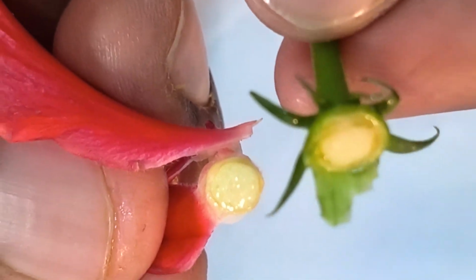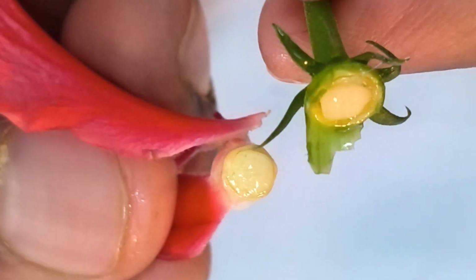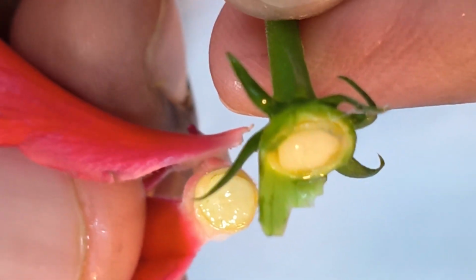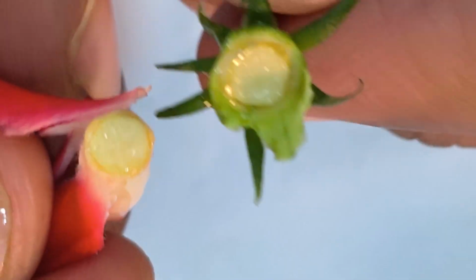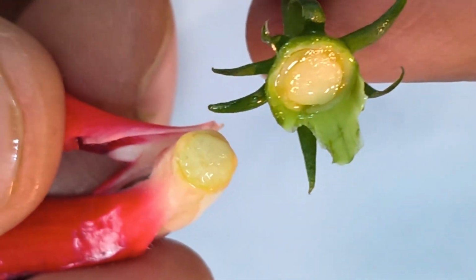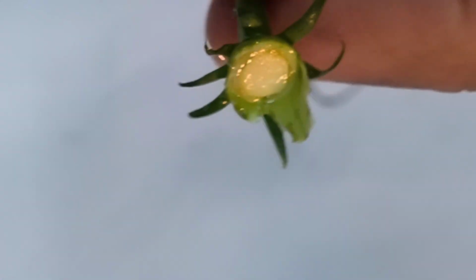Let me see whether this is very clear. Ah, so you can see box-like structures. They are called carpels. So this is a multicarpellary condition, and all carpels are united. So it is syncarpous, with a superior ovary, and many ovules on axile placentation.